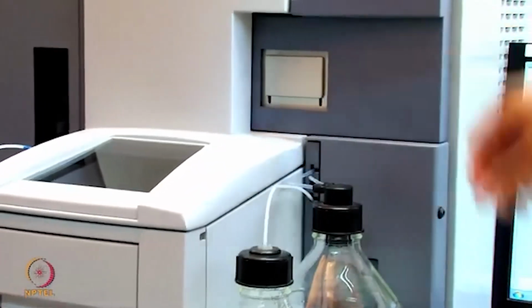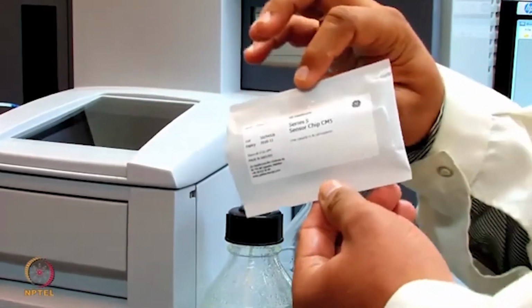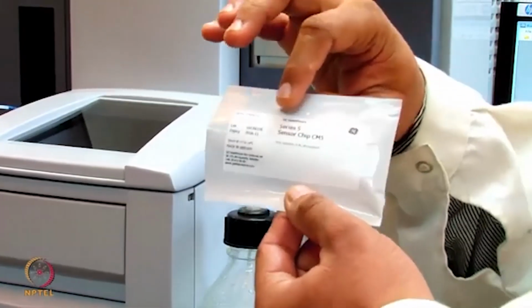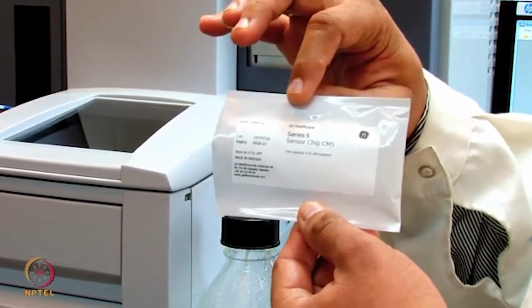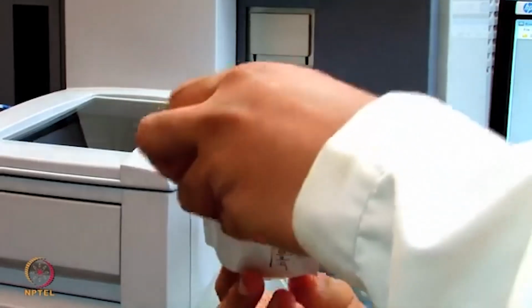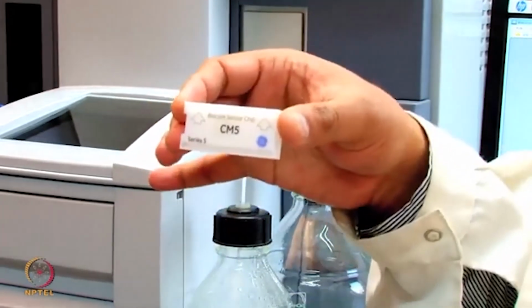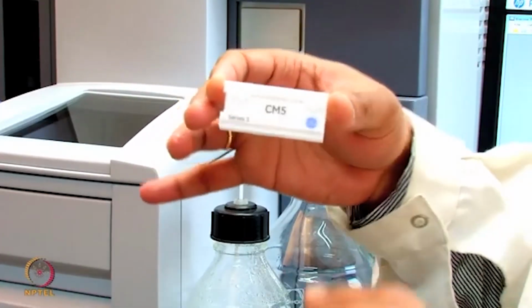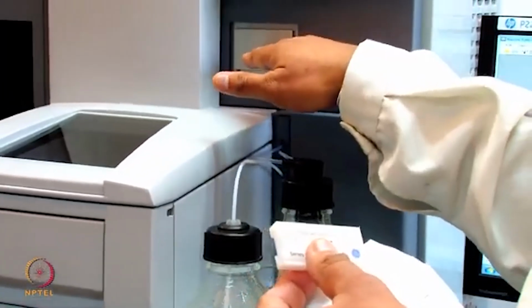So let us look at the chip now. So this is a new chip. The chips are generally provided in these cassettes, and the new CM5 chip will look like this. This chip will be inserted in the chip docking area.